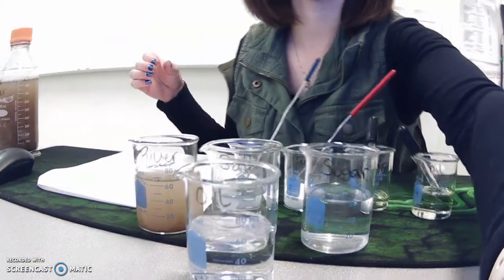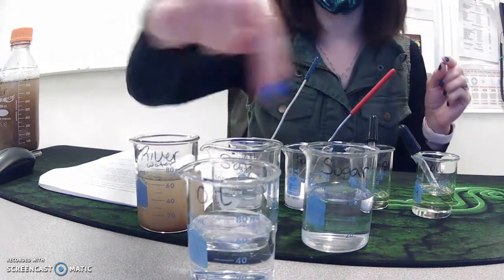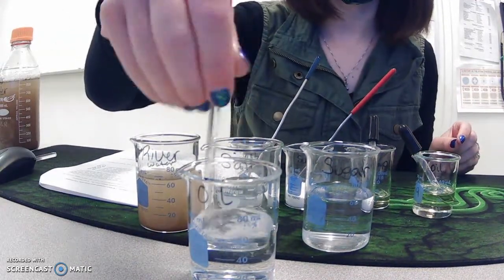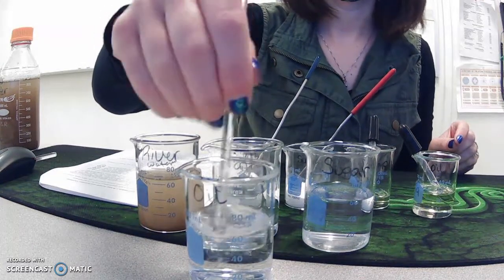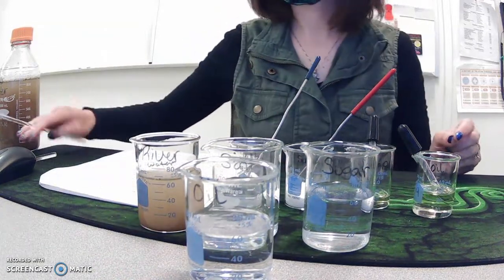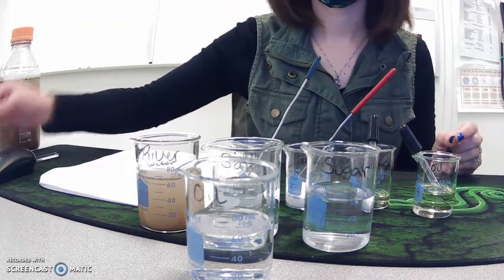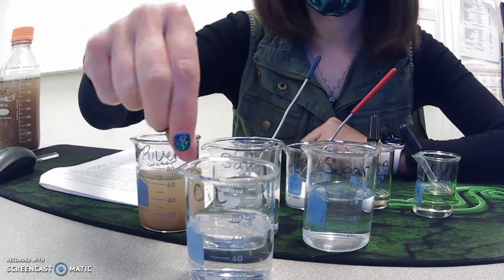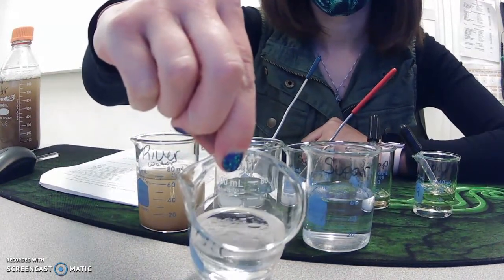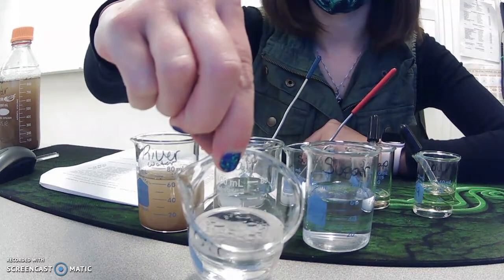If we were to stir it in, the oil is right here floating on top. As we stir, we still see the oil kind of separated in there. There's our oil and the water.